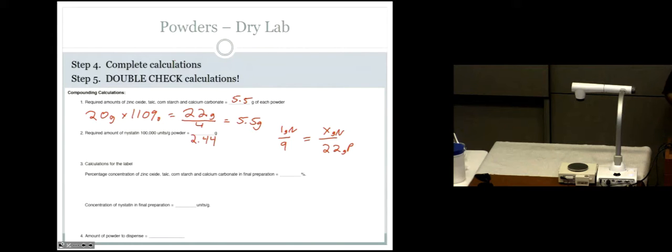All right. So for an example, how do we label the active ingredients in a topical powder? How do we express their amounts? Not by weight, but we express it as percent weight per weight. Okay, so we need to be able to say for all of our ingredients, what is their activity or the amount there by percent weight per weight. So let's just do that for the 4 base powders. Not hard. How much drug, how much base powder individually is in each one? We're going to weigh out how much?